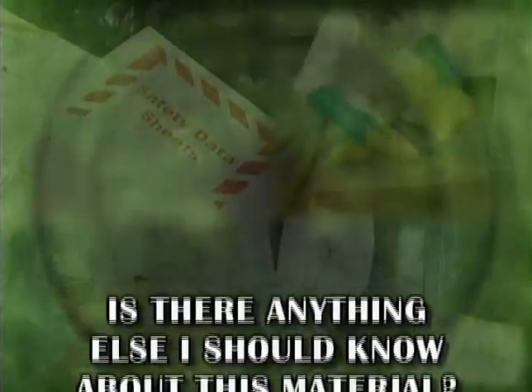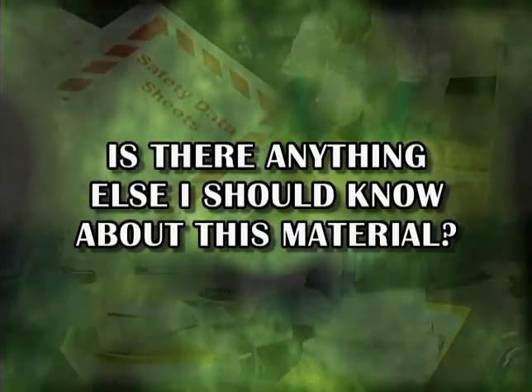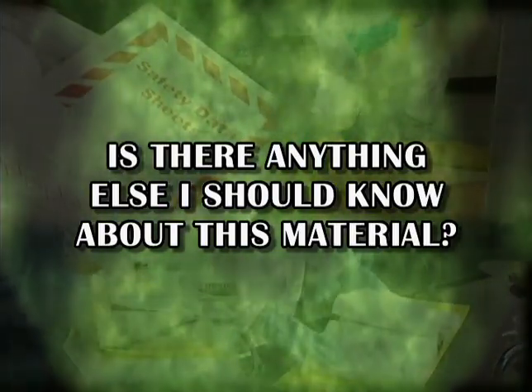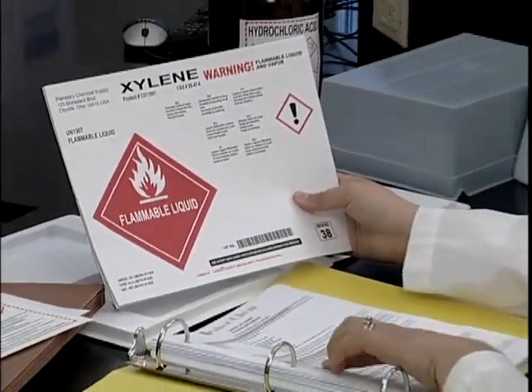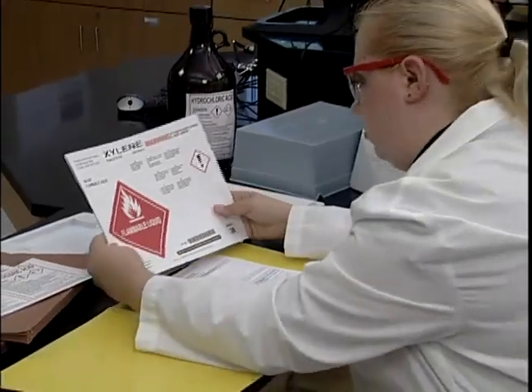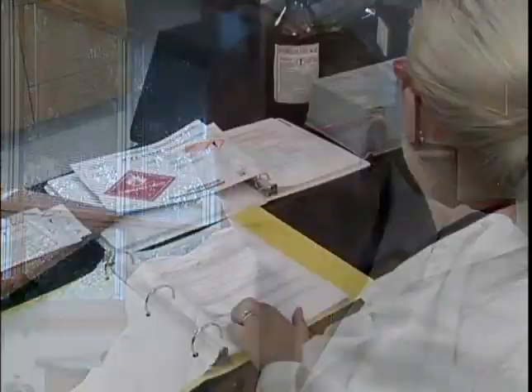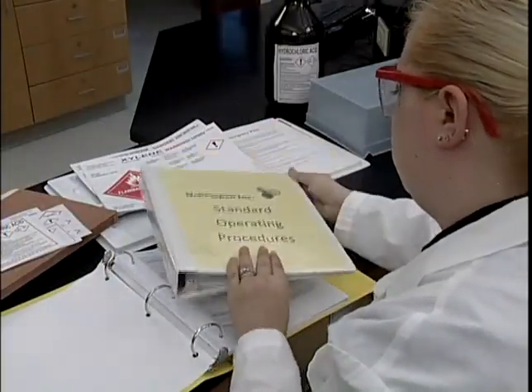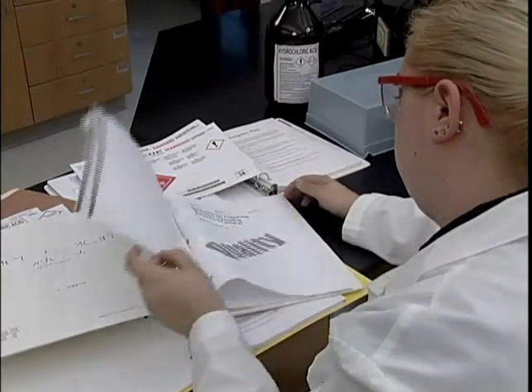This brings us to the fourth question the GHS safety data sheet is designed to answer. Is there anything else I should know about this material? This information can be found in Sections 11 through 16. Most workers use this information under the guidance of health and safety professionals, such as industrial hygienists, environmental managers, and safety directors. However, your employer may also use these sections as a reference when setting up your company's standard operating procedures, so you might want to take a quick look at this information.